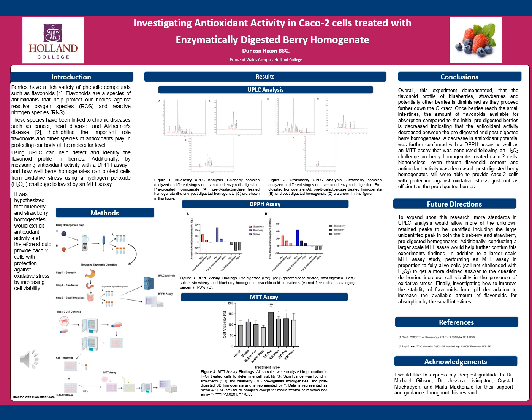Furthermore, scavenging ability refers to the ability of a sample to mop up free radicals. These two tests go hand in hand, as the greater the antioxidant and flavonoid content, the greater the scavenging ability of a sample should be.